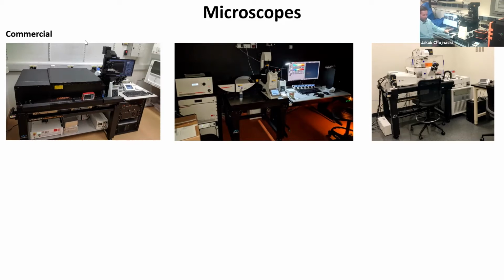I will tell you about some details of it in a moment. But just to show these images for you to appreciate that these are actually quite complex, large, and expensive devices, which are used for fluorescence microscopy. And these are generally commercial systems. So companies build them, and then scientists use them.